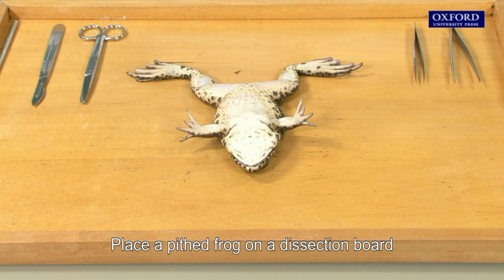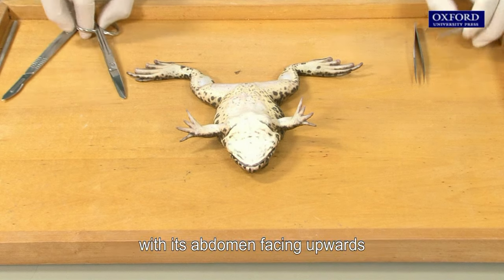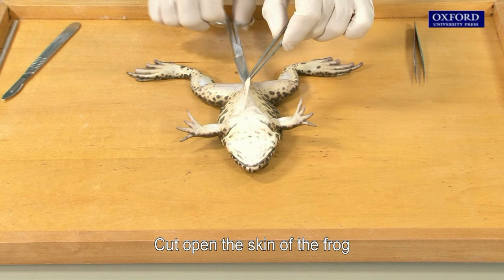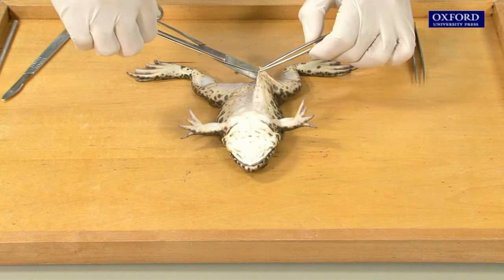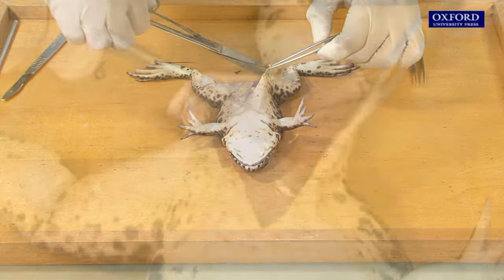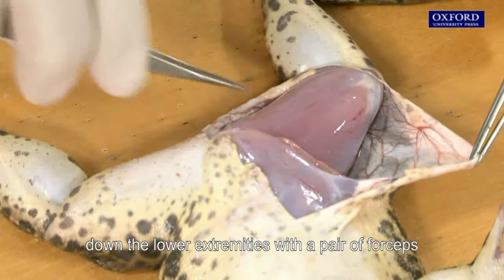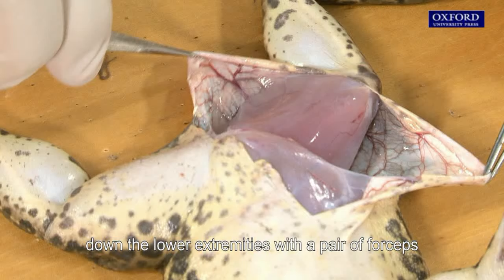Place a pithed frog on a dissection board with its abdomen facing upwards. Cut open the skin of the frog, then peel off the skin from the abdomen down the lower extremities with a pair of forceps.